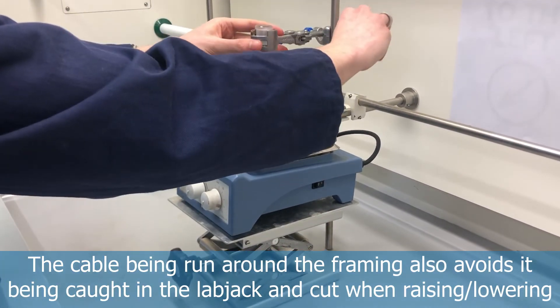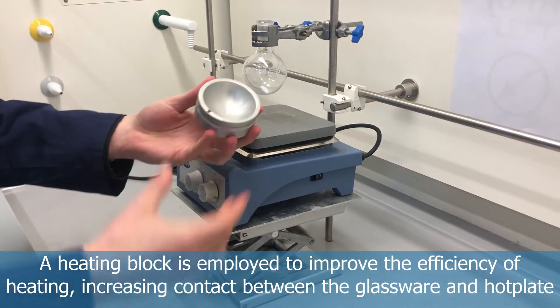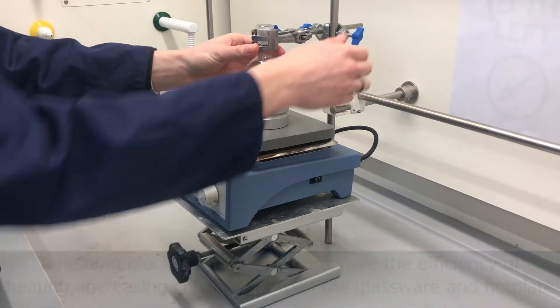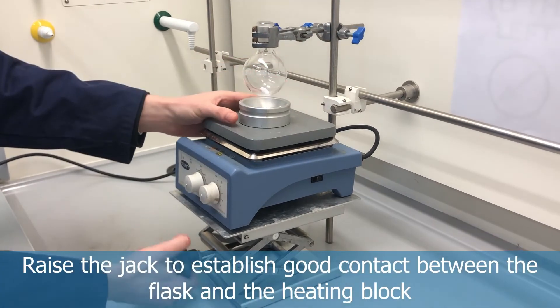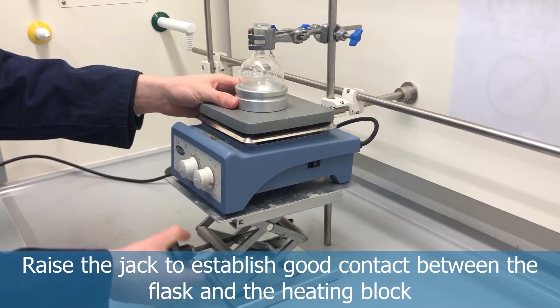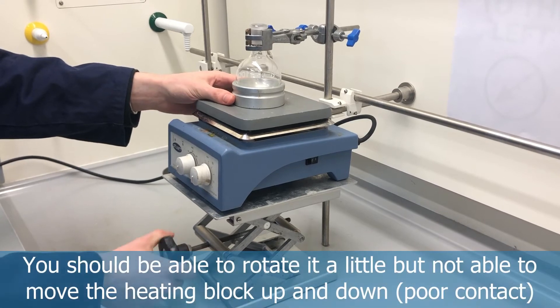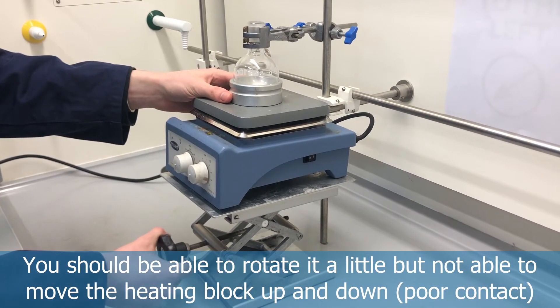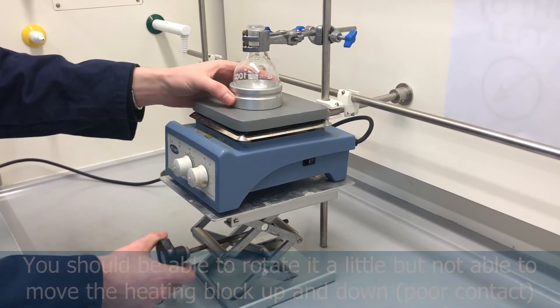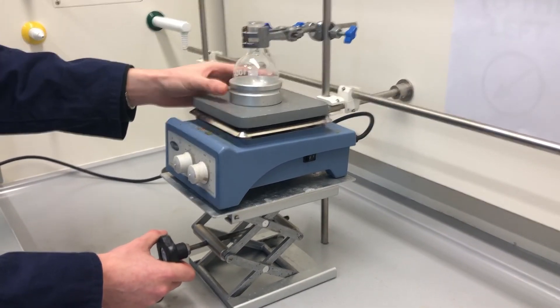You can see how winding the wire around the frame removes it out of the way of the lab jack, which could otherwise cut the cable. We add a heating block, which increases the contact between the glassware and the heating element of the hot plate, and we raise it to establish good contact with the glassware. As shown in the zoomed-in shot, we can rotate the heating block but we cannot raise or lower it, as that would result in poor contact and inefficient heating.